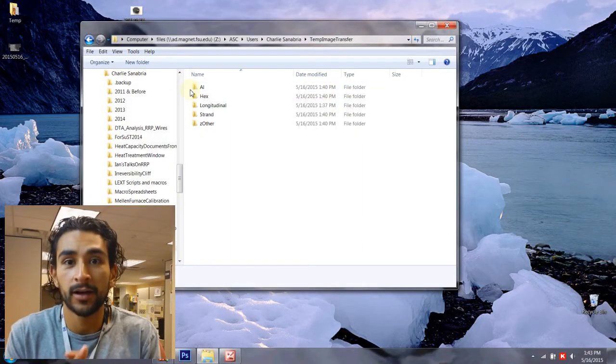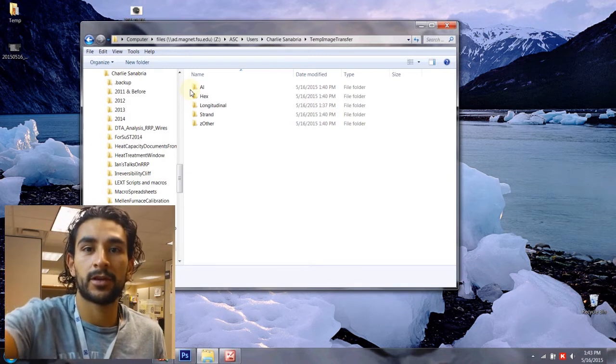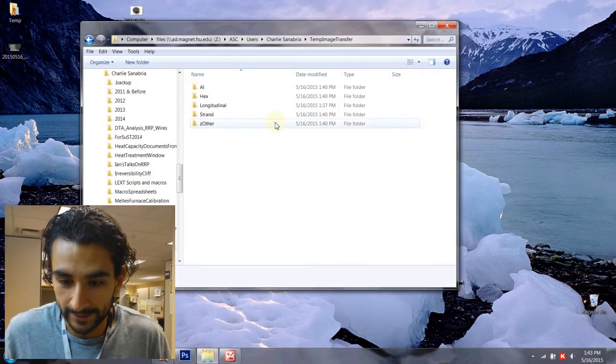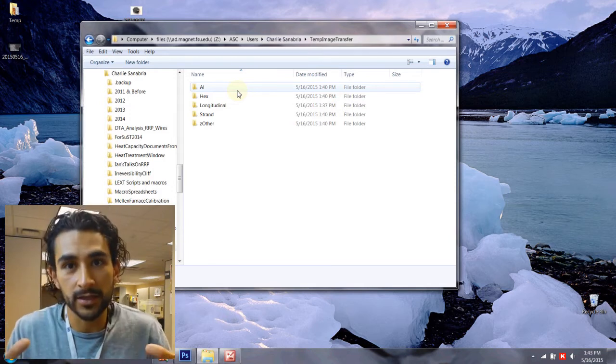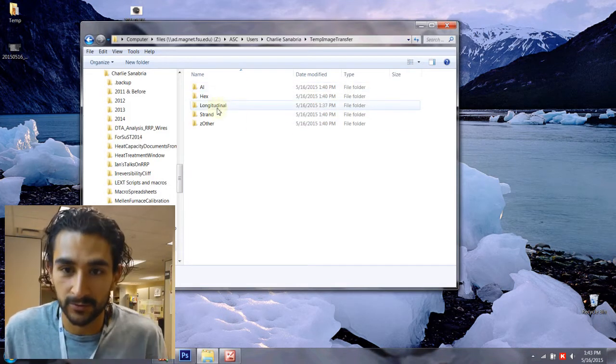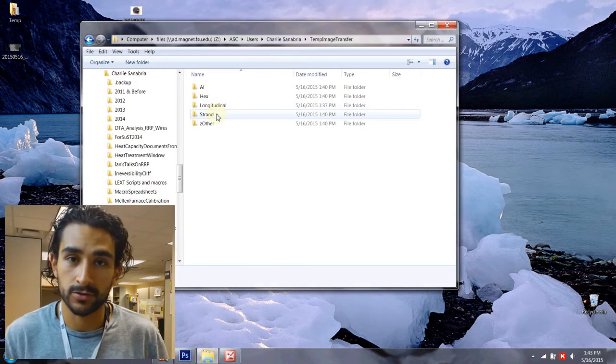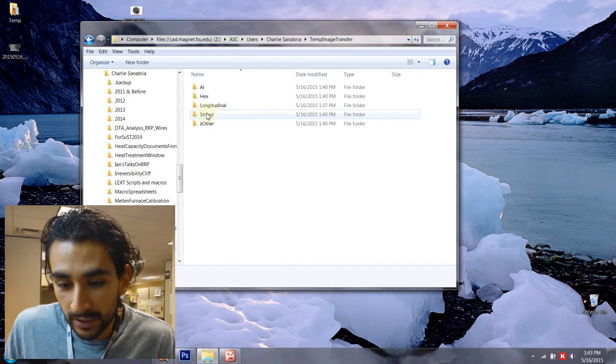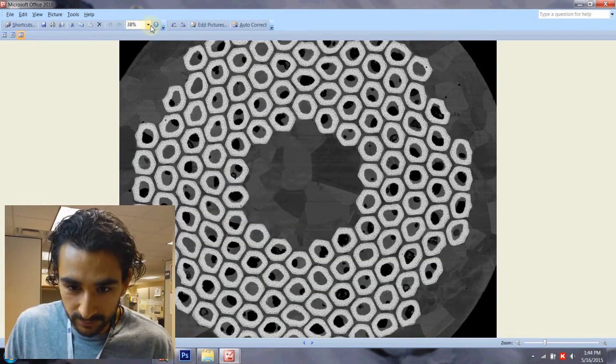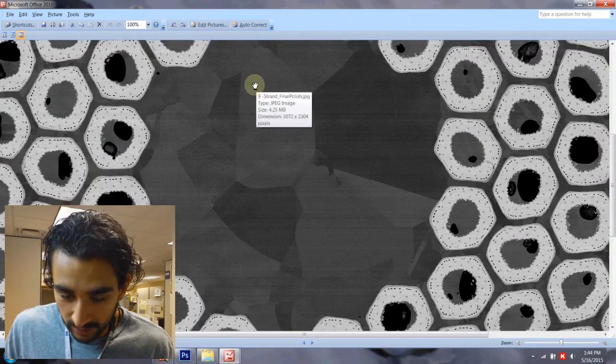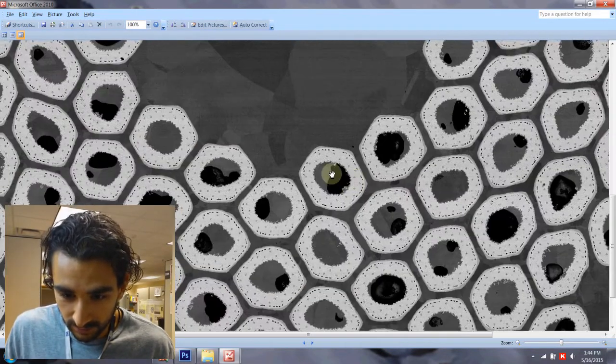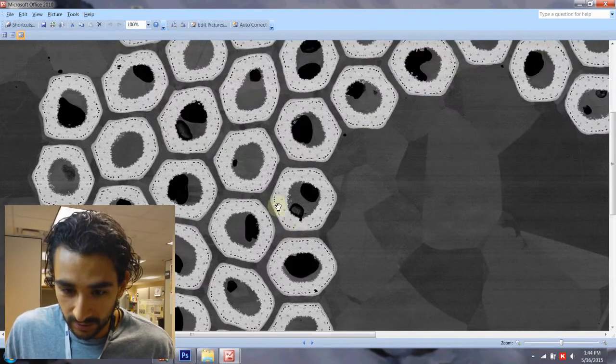Alright guys. So let's take a look at what we have so far. Let me show you the pictures and I've already taken the samples out of the Vibramet and I've cleaned them properly, make sure that there were no stains, no nothing before I took them to the microscope. And here are the final pictures which are the ones that you should be using to measure or to show them in a presentation or to publish them in a paper. And if we start with the strand, this is the final polish image. So it looks pretty good. Let me take that to 100%. And the image is very nice. This was taken with a scanning electron microscope so you can tell the Z contrast of each one of the components. And this is perfect.